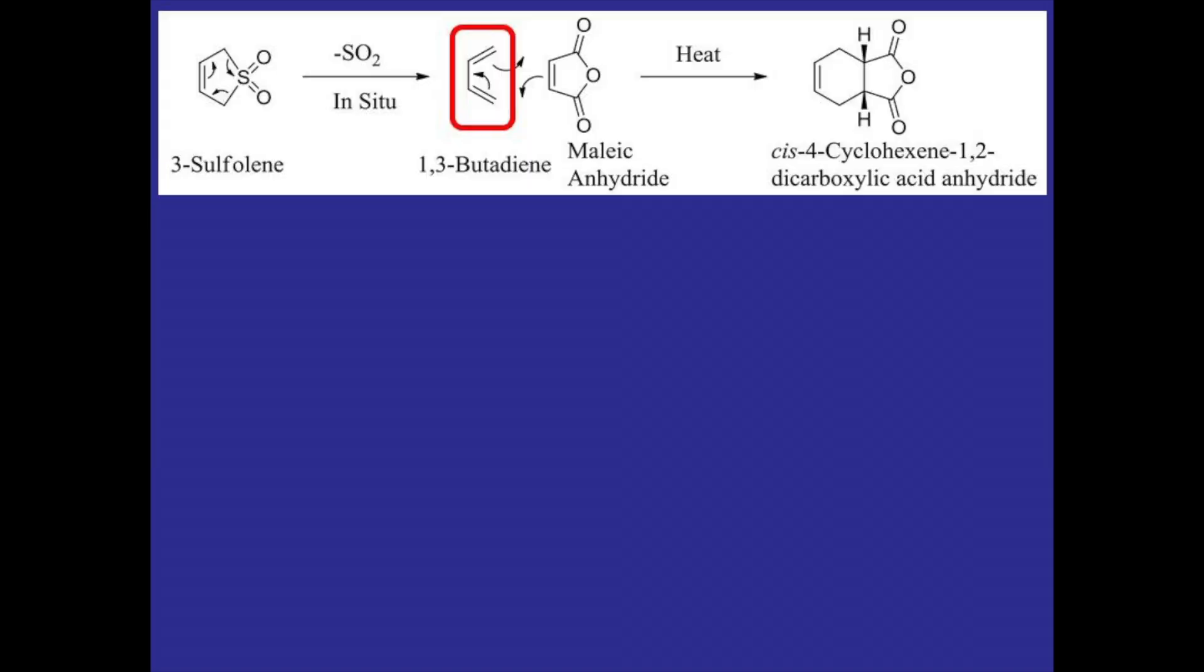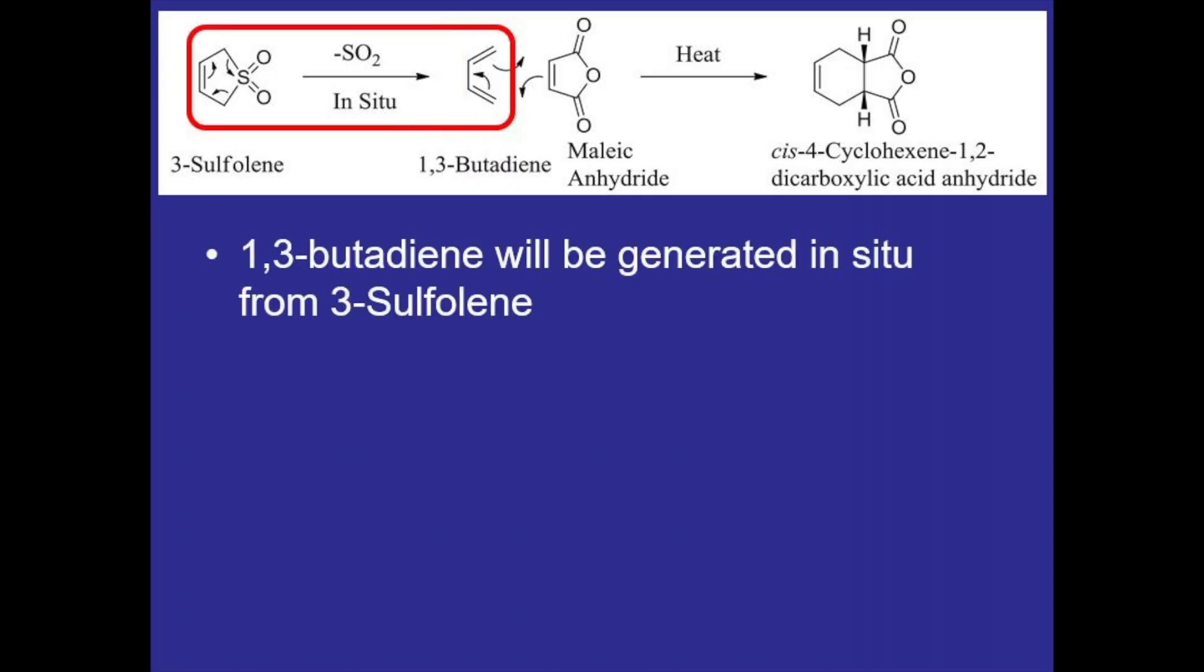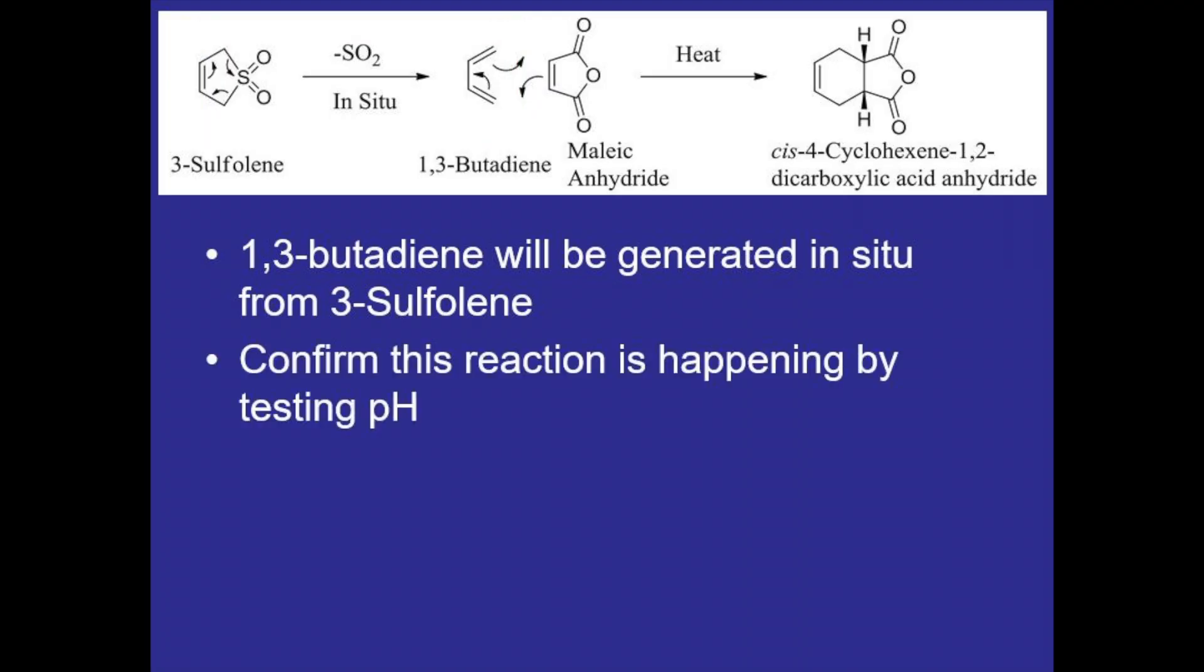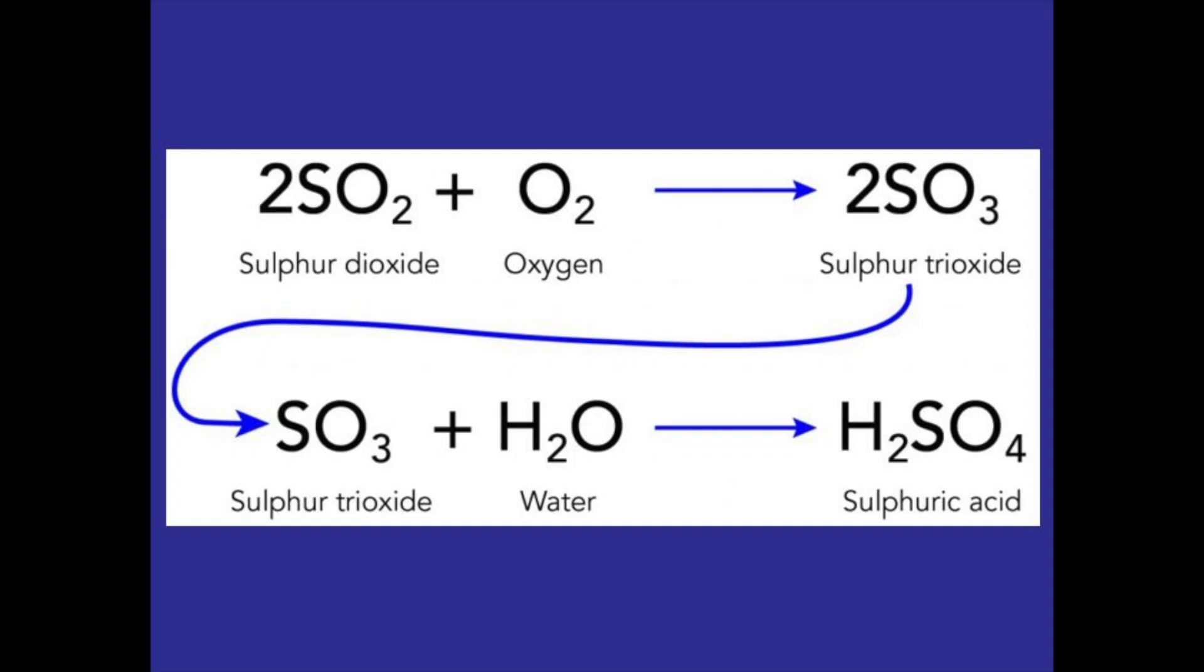The 1,3-butadiene used in this reaction is a gas at room temperature which makes it difficult to measure and handle, so we'll actually be making it in situ using 3-sulfolene as the reagent and we can confirm that this reaction is happening by testing the pH. Sulfur dioxide is released in this reverse Diels-Alder type reaction and as it reacts with oxygen and water it'll eventually turn into sulfuric acid which we can then pick up on a pH strip.